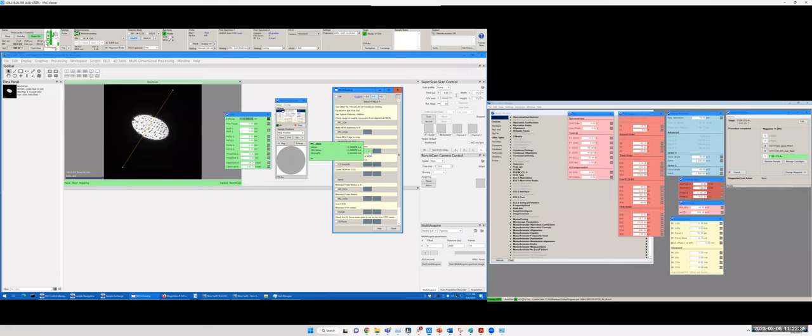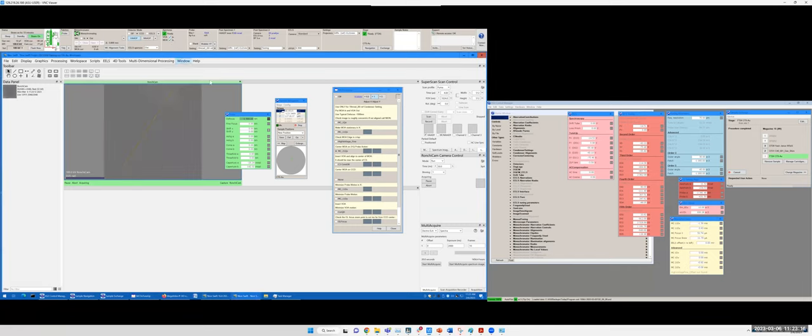We can either look at the gold, just go here. Yeah, because it's so off, right? You don't see clearly something. But you can roughly see it should be somewhere here, right? For this procedure of alignment, it's roughly there. Okay, let's go there. And let's see if the VOA is here. Now we want to put VOA in and see if VOA is there. Okay, unfortunately, VOA is not there. So we need to change this.